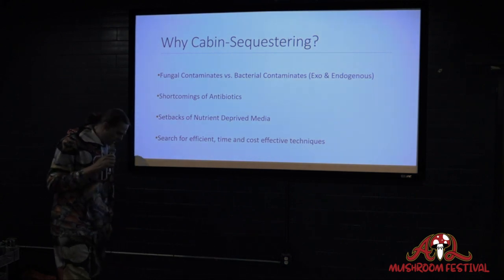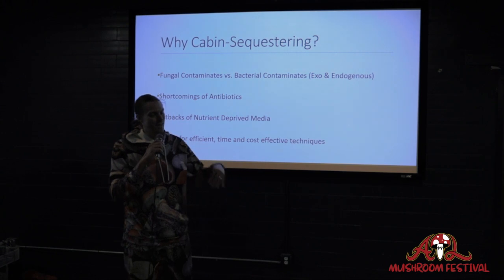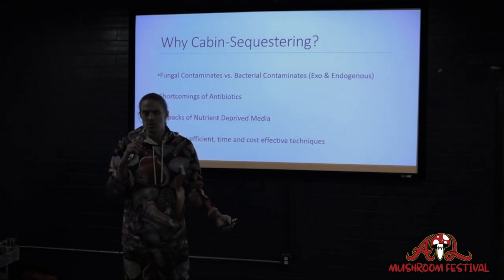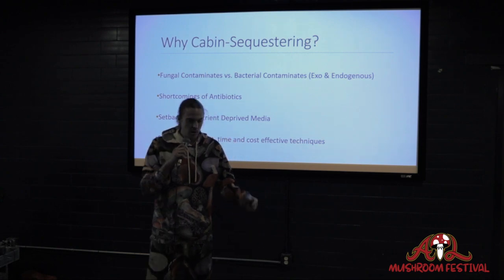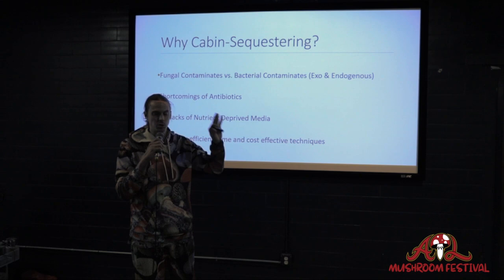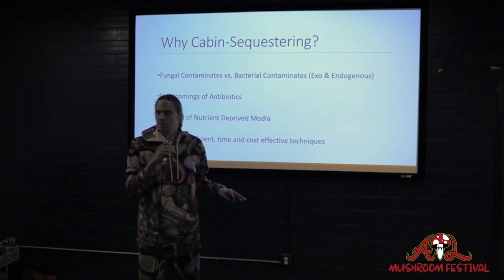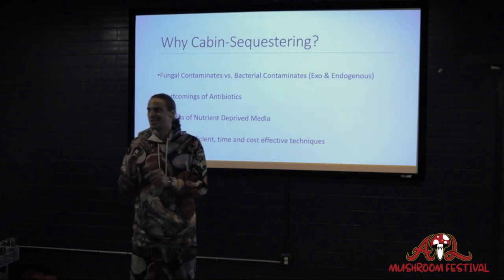And so if you have an endogenous infection, it's very hard to tell that it's infected. You'll grow mushrooms and you might have success once or twice, and then all of a sudden you take your agar plate or your liquid culture and you put it in a grain bag or your substrate, and then all of a sudden it's just mushy. Constant infection. You don't know why. You think it might be the technique, it might be this, it might be that. No, the infection was with your culture from the very beginning, but you just didn't see it.